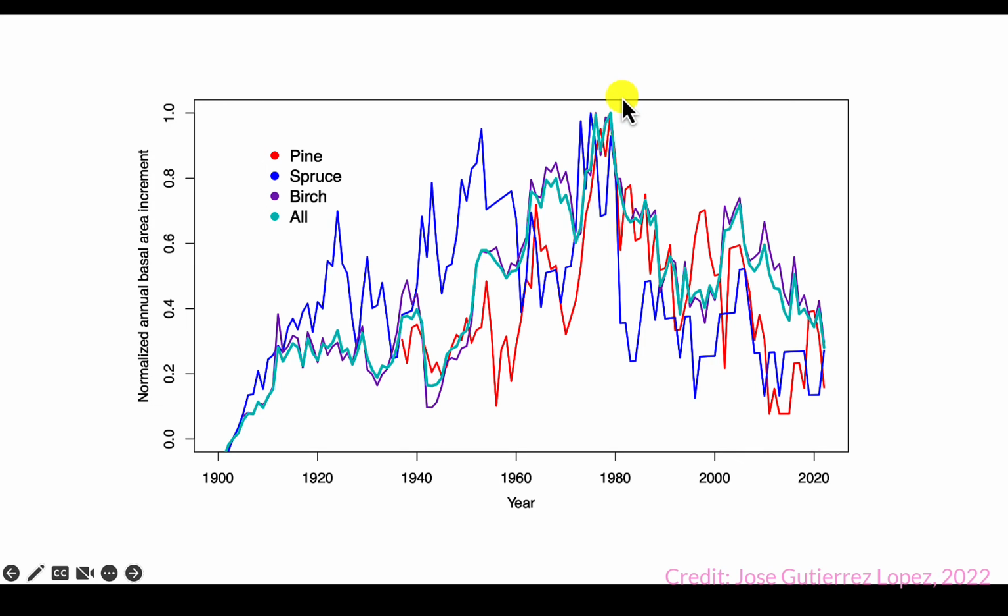I normalized these values because the idea was just to show them all on the same graph. Otherwise, big trees will just be way up there, small trees will be way down here, and we will not be able to compare the actual trends. That's what I used to see if I'm missing rings or if there's a false ring, etc. I look at the trends and try to see that they sort of follow a slightly logical sequence.